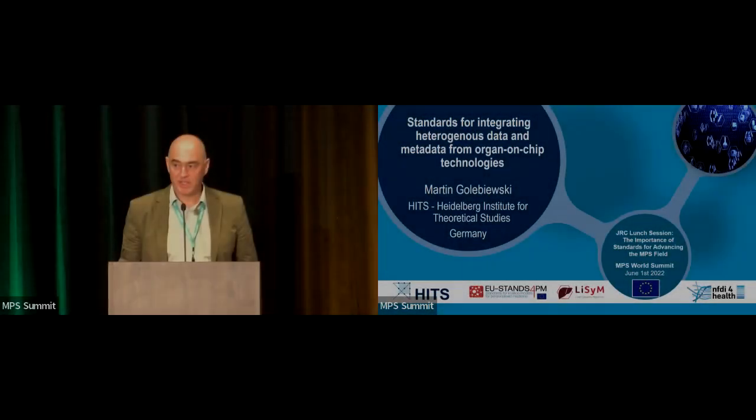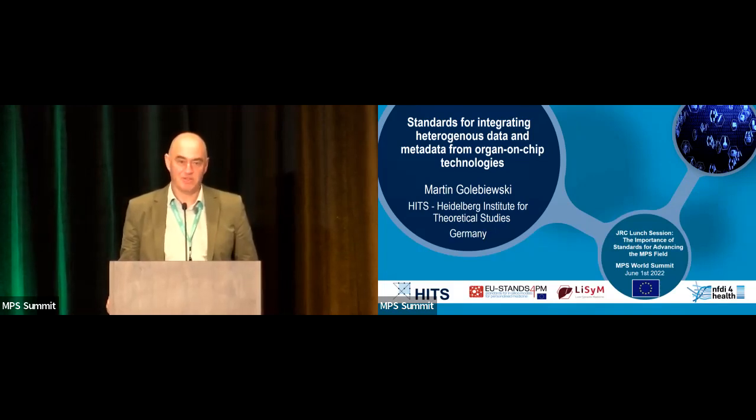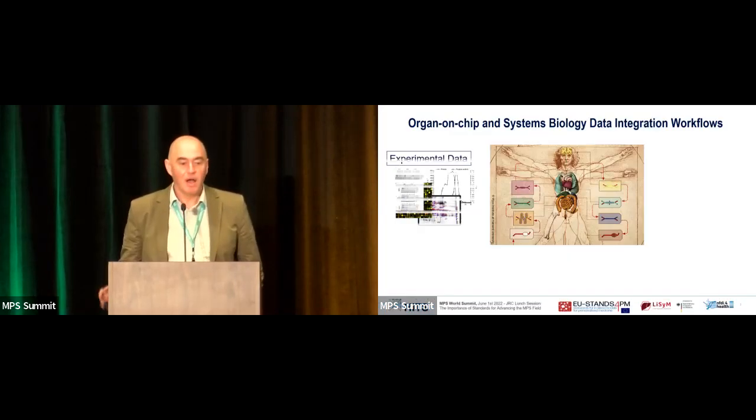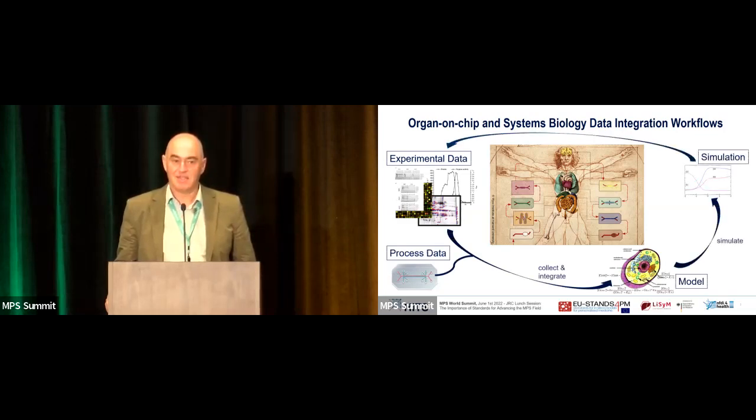I think the question just before highlighted, as well as the debate before, highlighted the importance of data. And we also heard in the keynotes about that. So I want to give you a few insights in the data standardization that is needed and that is already to some parts available, at least for some parts of the data.